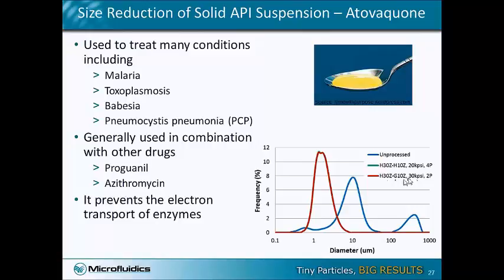So we can essentially deliver the same results in terms of particle size and particle size distribution with a different route. So it depends on your requirement or need.